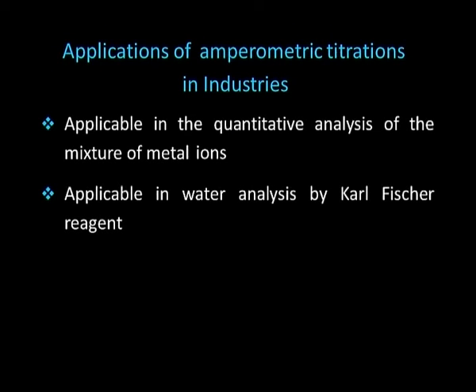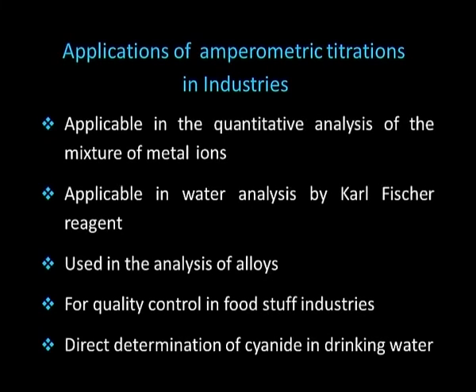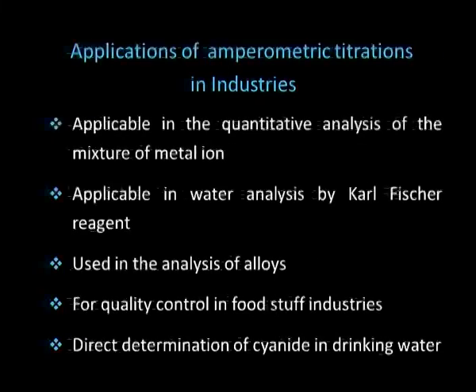It is applicable in water analysis by Karl Fischer reagent, and it is used in the analysis of alloys in various industries. For quality control in food stuff industries, amperometric titrations are widely used. Direct determination of cyanide in drinking water is possible by using amperometric titrations.